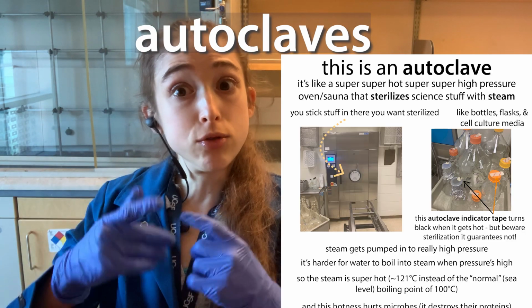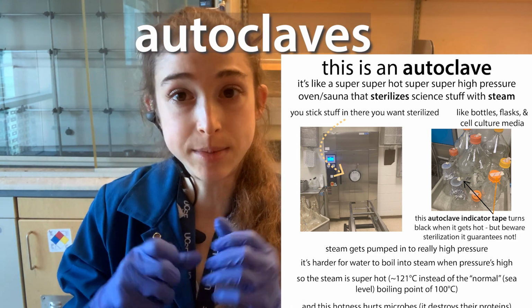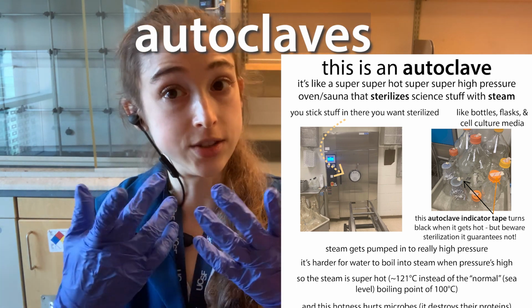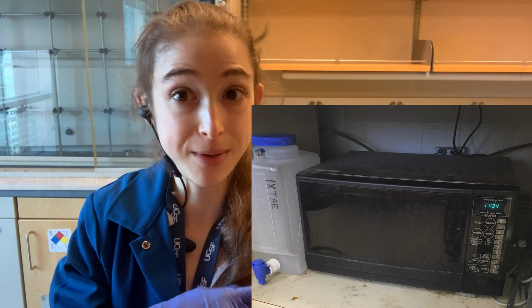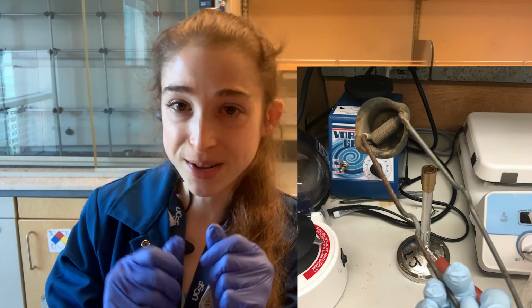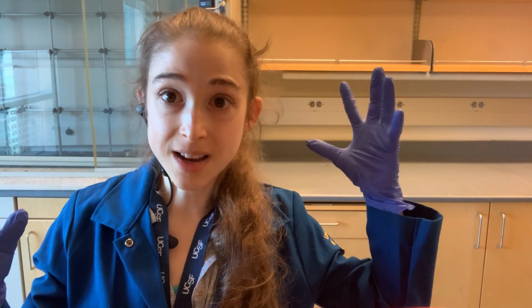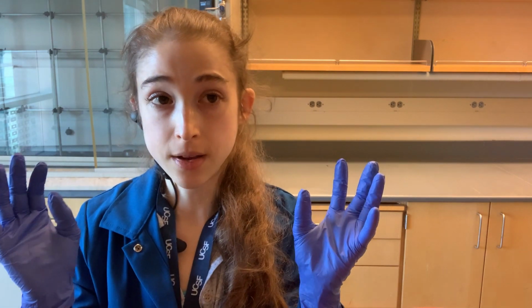Another time we get things really, really warm is in an autoclave. This is one of these steam sterilizers that gets things to really high pressures and really high temperatures in order to sterilize things such as our LB agar, that we then let solidify if we're not using it right away, and then we microwave it so we can pour plates, and then we use the Bunsen burner to keep a sterile environment around our plates. So we use all these different things to heat things up depending on our purposes.